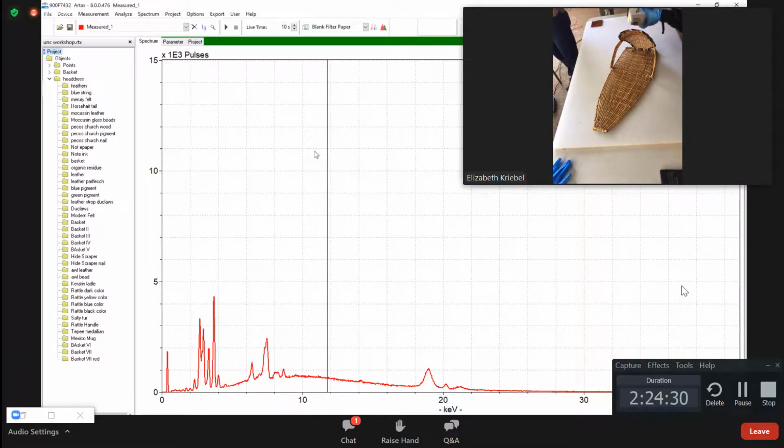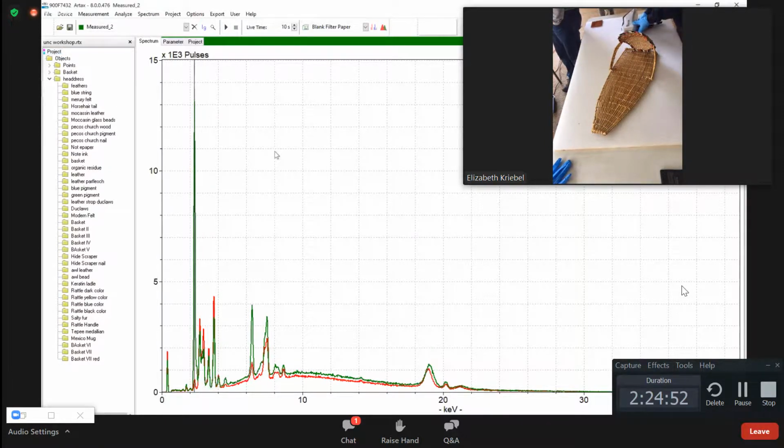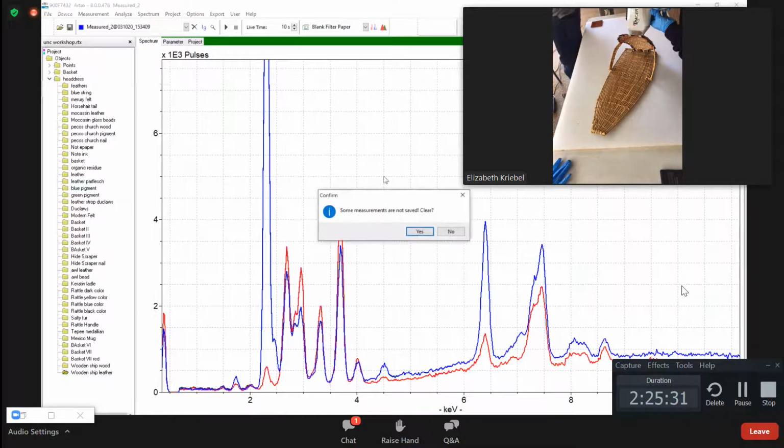Let's get that twine blue, because the last time we saw blue twine, it was trouble. Okay, I'm ready. All right, starting. Got it. A lot of sulfur, but nothing toxic. If it's leather, that would make sense. It doesn't look like it's the color, because I don't see any correlates with other elements. So yeah, it's compositional. And do we want to test any of the fabric edges? We can. Yeah, let's go ahead and do it. Okay. All right. Wood. I'm ready when you are. Okay, starting it now.